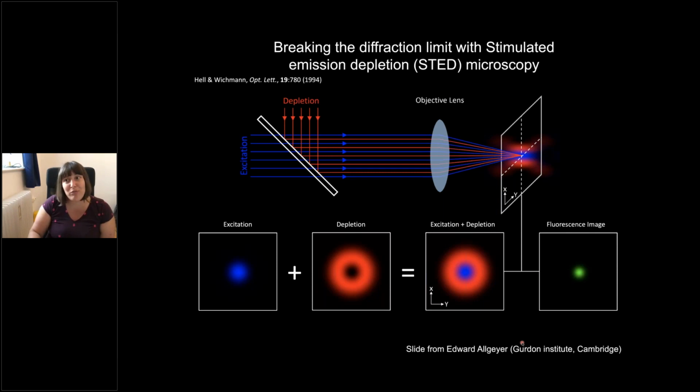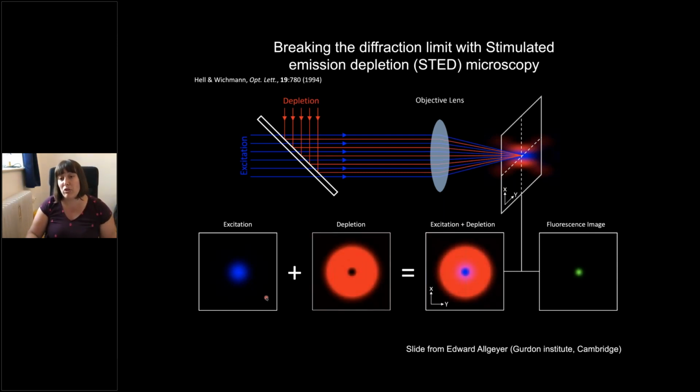And just a brief introduction for the few of you that haven't seen the previous webinar and are not familiar with STED. So a STED microscope is basically a confocal microscope where a depletion donut is overlaid to your excitation beam. And what this depletion donut does, it switches off the fluorescence around the excitation. And if you saturate this depletion donut, your resulting fluorescent imaging is a sub-diffraction size point spread function. So it's around, I would say, 30 nanometers, also in the XY direction, also on commercial STED microscopes.